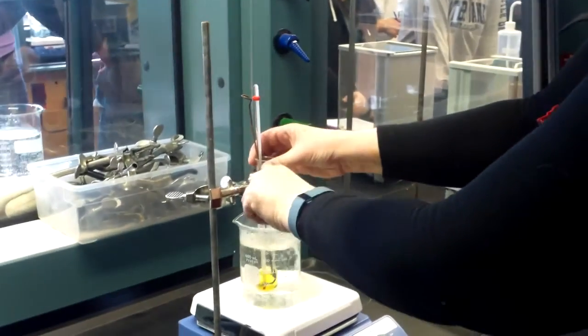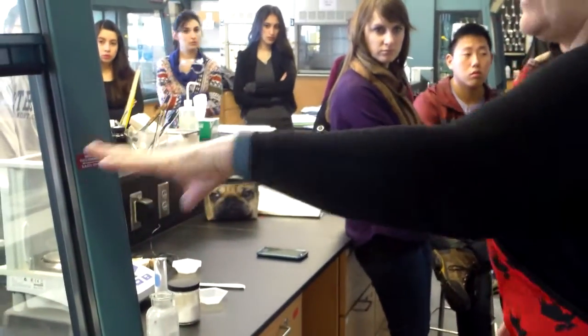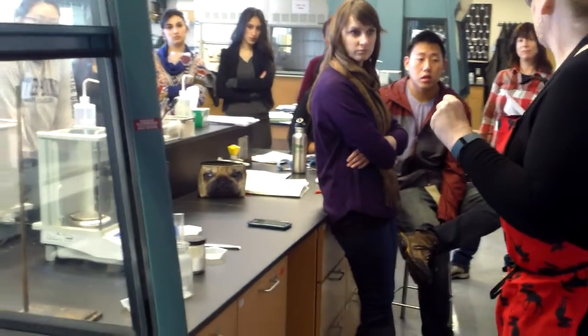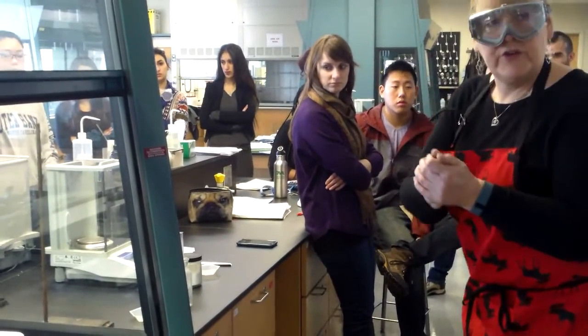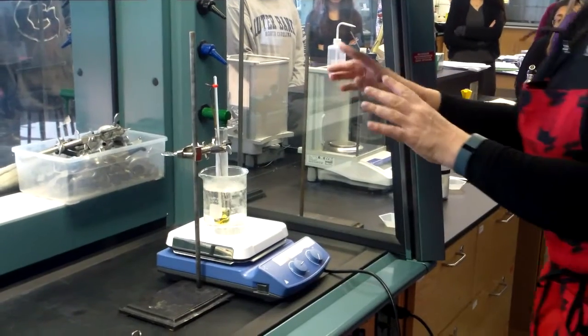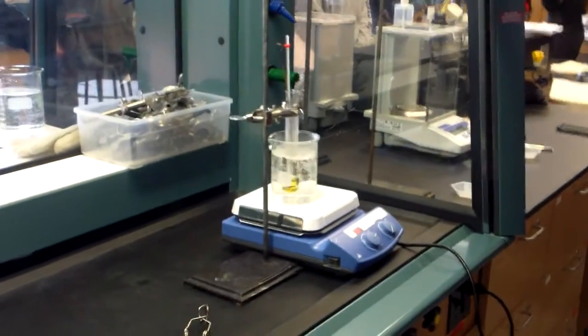At this point, what you have is a container of semi-solidified naphthalene and unknown, which now we have to dispose of. How do we dispose of it? Hazardous waste, thank you, the chemical waste container. To do that, melt it one more time. And once it is nice and melted, the hazardous waste container is over in that far hood.